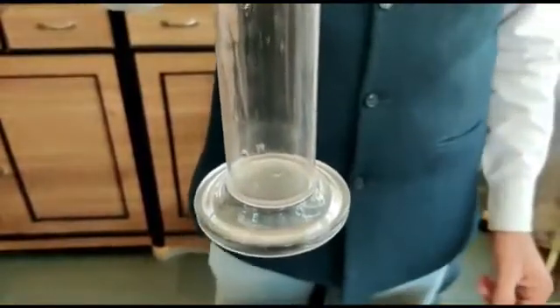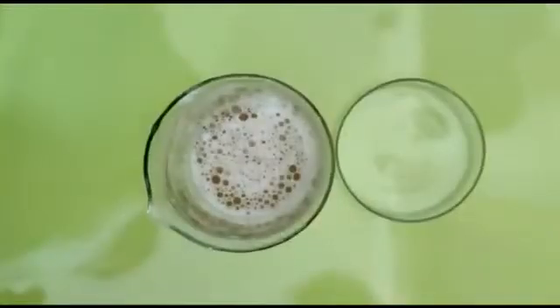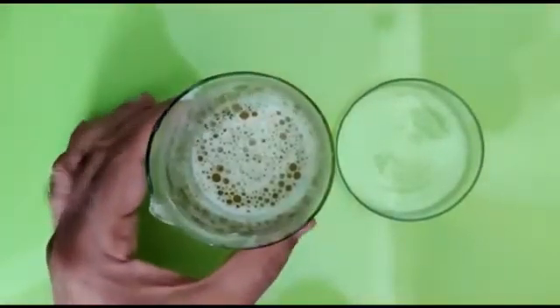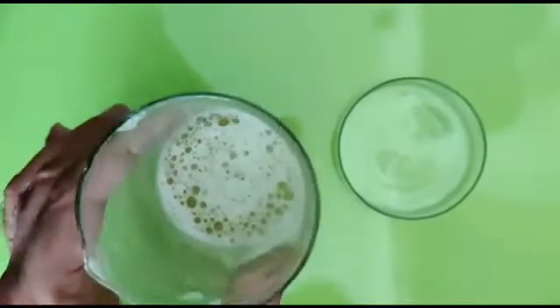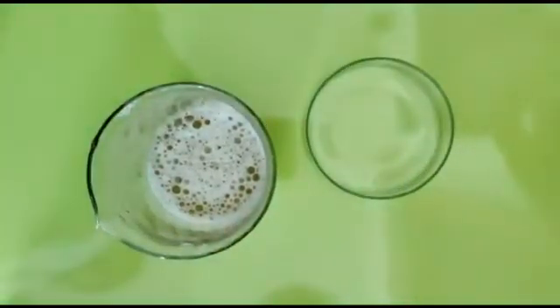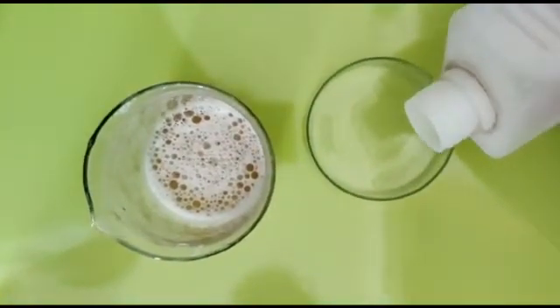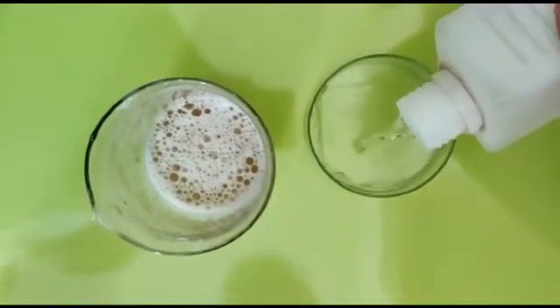You can see that drop by drop, the filtrate is coming down. So now this is the filtrate. In this petri dish, we are taking chilled ethanol, three to four ml of chilled ethanol.